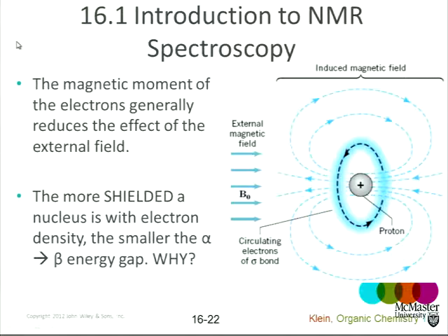The other two carbons move further to the left, a higher chemical shift. And they do that because this carbon has a CO polar bond with the oxygen pulling electrons away from it. This carbon is delta plus, and the oxygen is delta minus. Delta plus means there's fewer than normal electrons around the nucleus. De-shielded moves to higher chemical shift. Likewise, the CH2Cl, the carbon-chlorine bond we've already seen, is polar, right? The carbon is delta plus. And so the carbons bearing the oxygen and the chlorine have larger chemical shifts than the methyl group in this NMR spectrum because they have electron withdrawing substituents.